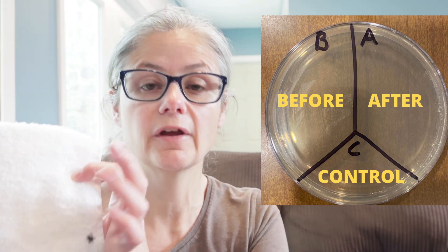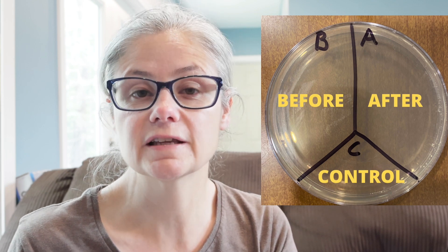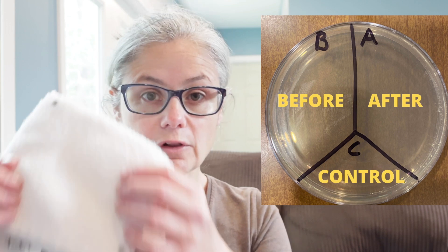Then I'm going to take a petri dish just like this and label them A, B, and C. I'm going to take some sterile swabs, and I'm going to swab the cloth and place that sample in the section labeled B for before. Then I'm going to clean the cloths according to the OxyClean directions. When they come out of the washing machine, swab them again and place that sample on the section labeled A for after. So we'll be able to see how much bacteria is on the cloth before washing and after washing with OxyClean.